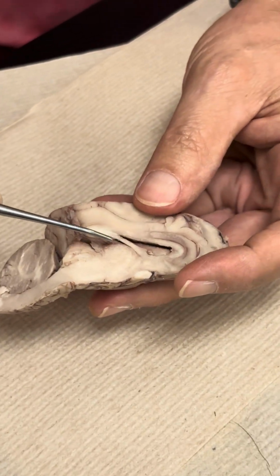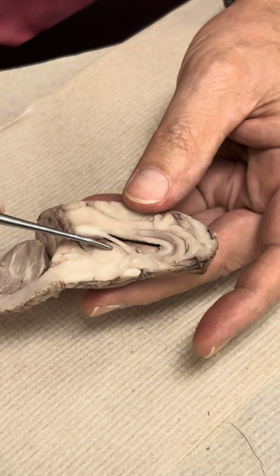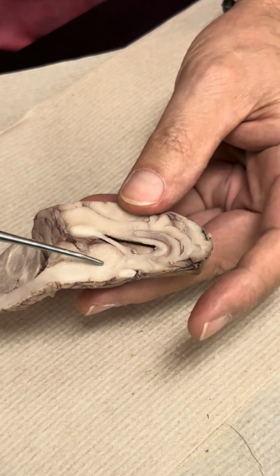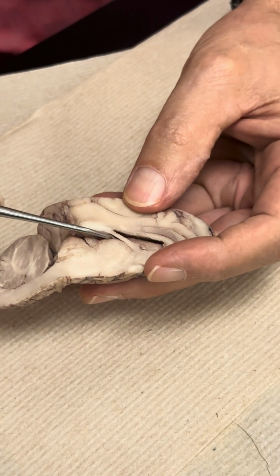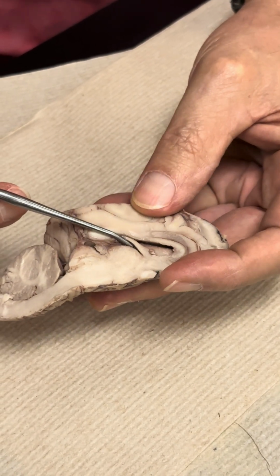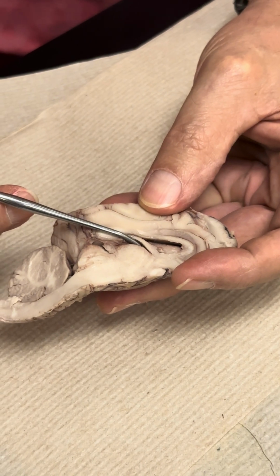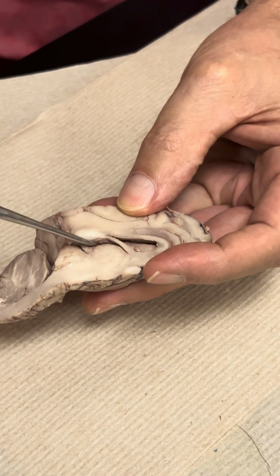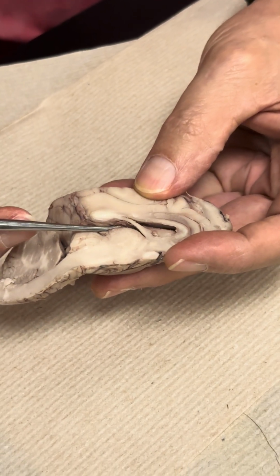Between the fornix and the thalamus, this is the thalamus right here, the left thalamic hemisphere, is the third ventricle. It is in the third ventricle that we have the choroid plexus, that brown stuff.